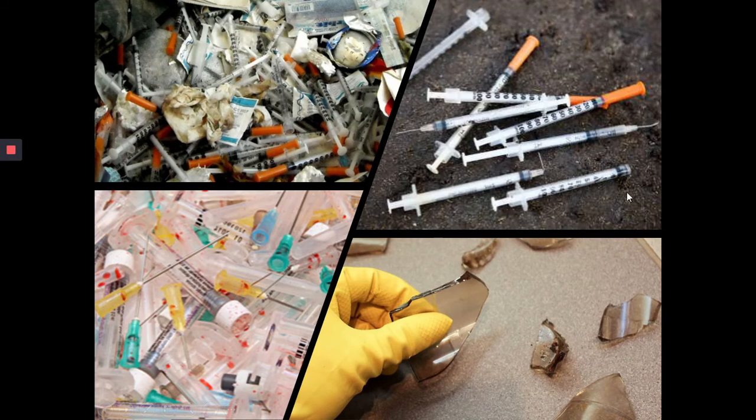These are photos showing syringes with used needles, especially since as medical technologists, one of our main jobs in the laboratory is to collect blood samples from our patients. So we must handle this type of waste carefully because it can transmit infection. Not only the used needles from our syringes, but we also have broken glasswares. We have to discard them in an appropriate sharps container.